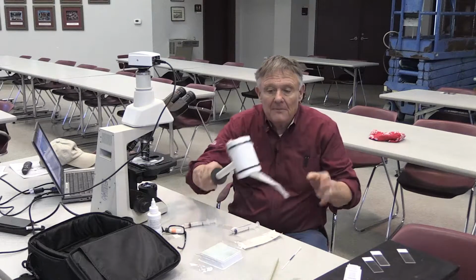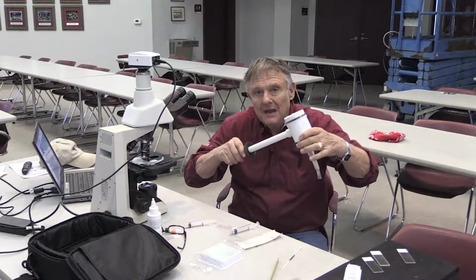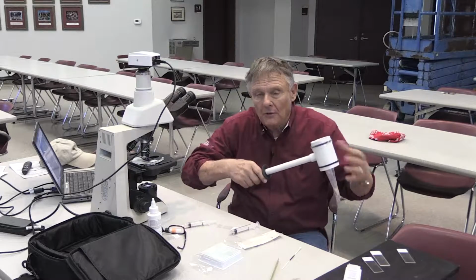And again, we talked about collecting that semen. We want to keep it warm, keep your hand around it. I think we did talk a little bit about how you can put a water jacket around it, a warm water jacket, if it's really cold in the winter. But you want to keep that semen about body temperature.